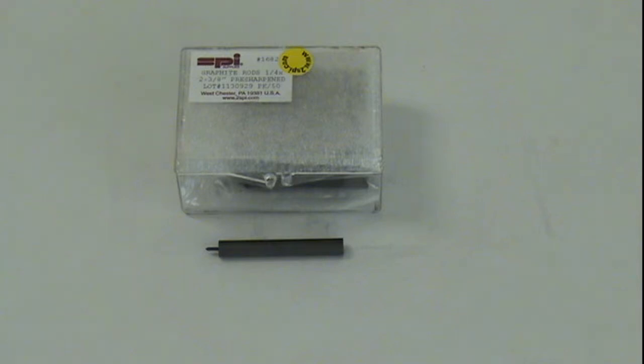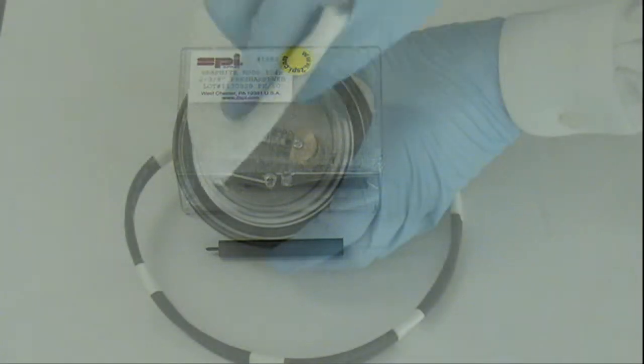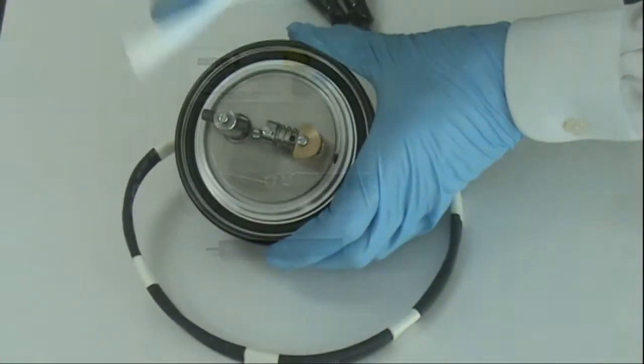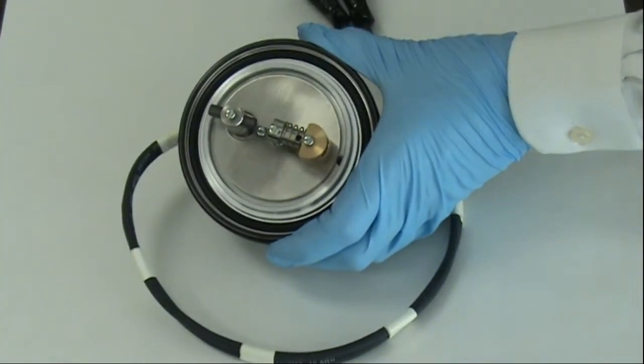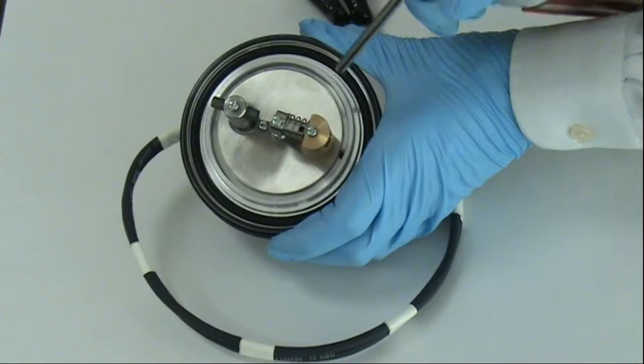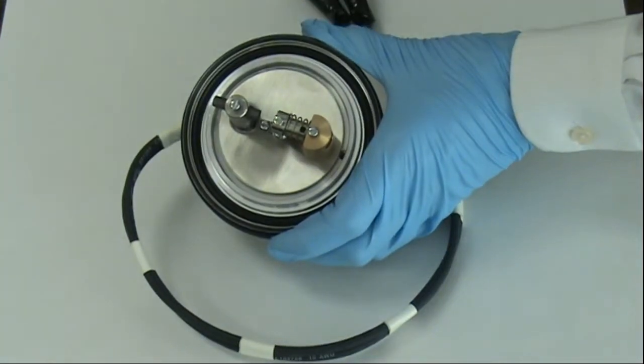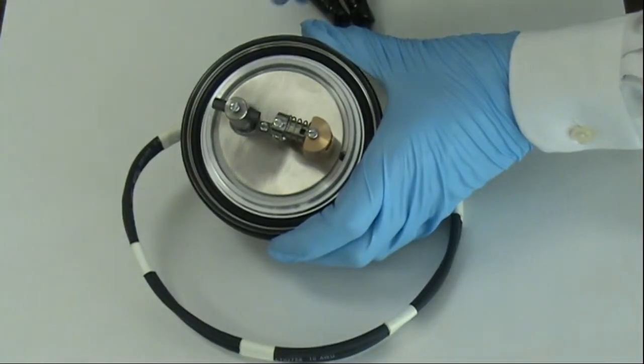While a full cleaning of the head between runs is not necessary, cleaning off any loose material will ensure that the next run will not be contaminated. Use an SPI Supplies easy duster and lint-free cloths to clean off the posts and shield.